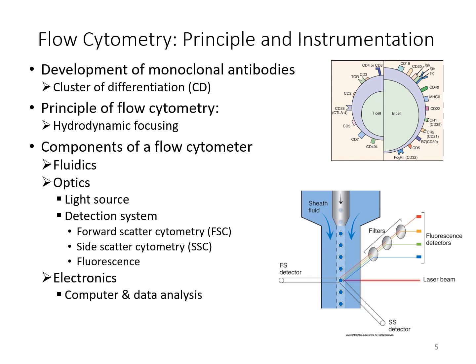So it compiles all this together, looking for those specific CD markers, placing them into a specific category, and then from there you'll use those various CD markers to narrow down what cell types you have, which aids in the diagnostics of figuring out what cells are present.